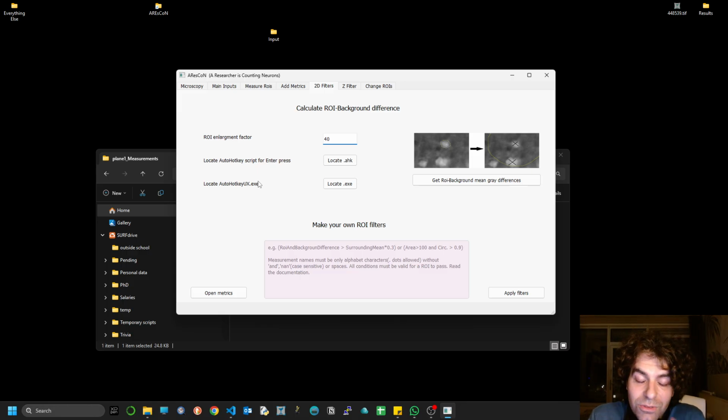But just to get into a bit more technical detail here, there were some occasions where, while running this filtering script to get a relative background, for some images an error would be raised. It was not an important error, but it needed the intervention of the user, who had to click OK for Fiji to continue running.